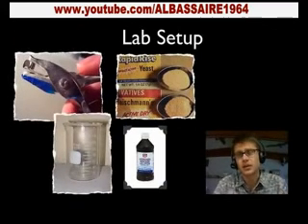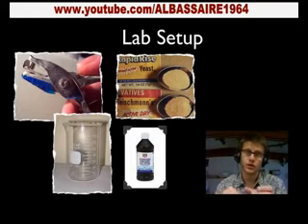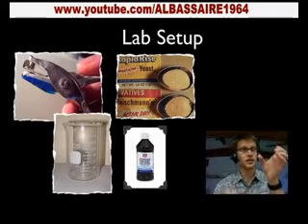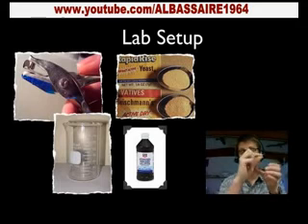Okay, so in this lab, the lab setup is fairly simple. What we will do is punch out chads, which are little discs of paper. We then dip those in a yeast solution, so we know the concentration of the yeast solution, and then we simply put it in a beaker of hydrogen peroxide. Imaginary hydrogen peroxide I'm holding right now, the disc will sit at the bottom, but as that enzyme starts to break down the hydrogen peroxide, little bubbles will start to build up on the outside of that disc, and eventually it floats to the top.